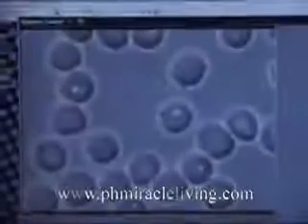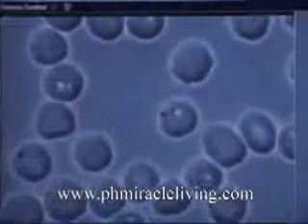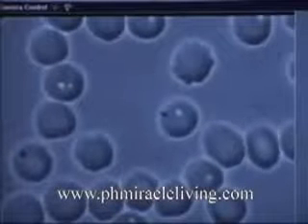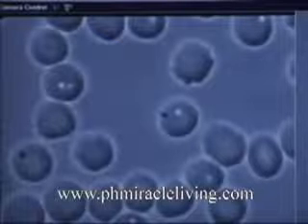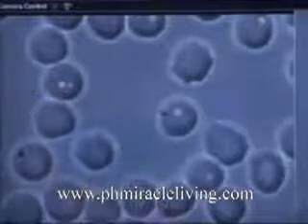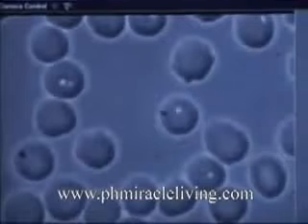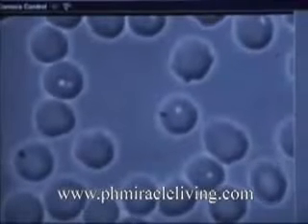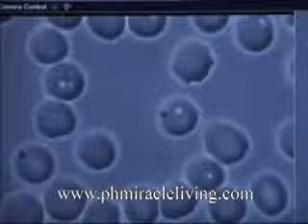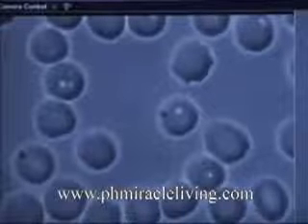So when we're looking at live blood, these are the red blood cells, or the erythrocytes. They're fermenting, much like a banana would ferment, getting its spots. These red blood cells have white spots. These white spots are an indication of fermentation. The cells are breaking down into sugar, and associated very much with diabetic type symptomologies.